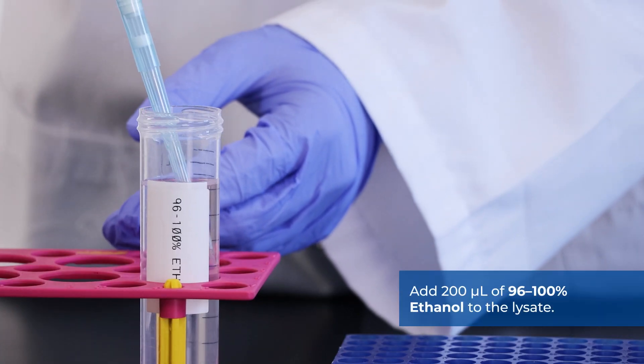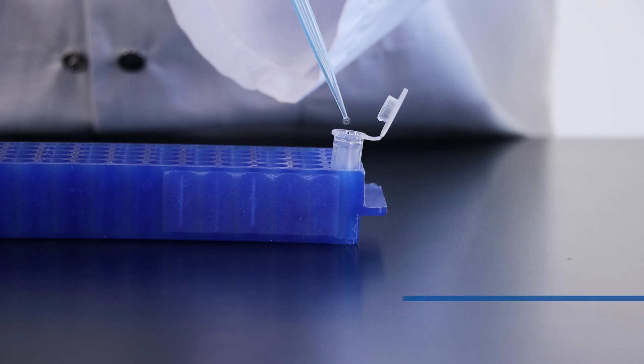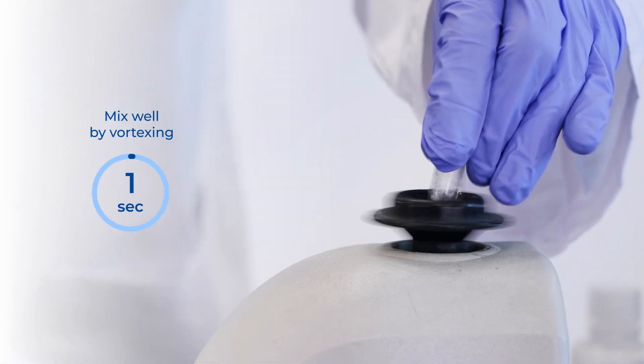Add 200 microliters of 96 to 100% ethanol to the lysate. Mix by vortexing for 10 seconds.